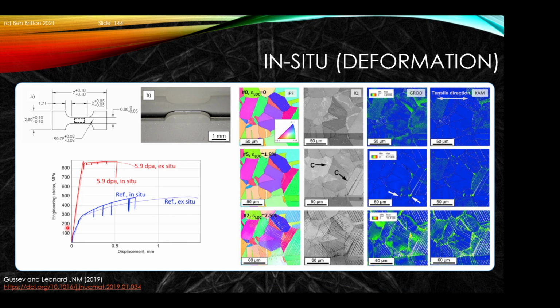The final example I think I've got for you is the in situ. So in an in situ experiment, there are multiple types, both heating, deformation, and a few others. But effectively in an in situ deformation experiment, you do repeat mapping subject to external actuation. In this case, they've done a tensile deformation, and they've unloaded to reduce creep, measured, reloaded, unloaded to reduce creep, measured, reloaded.